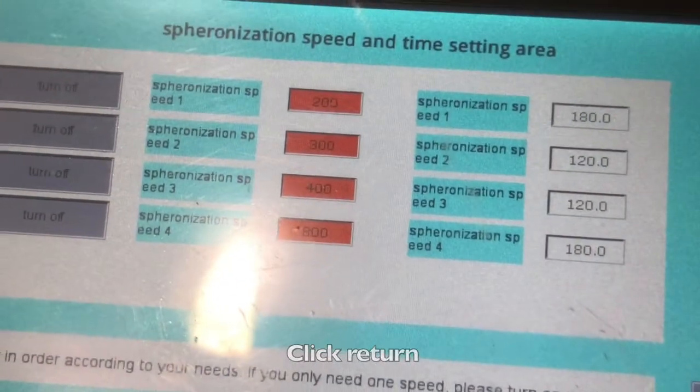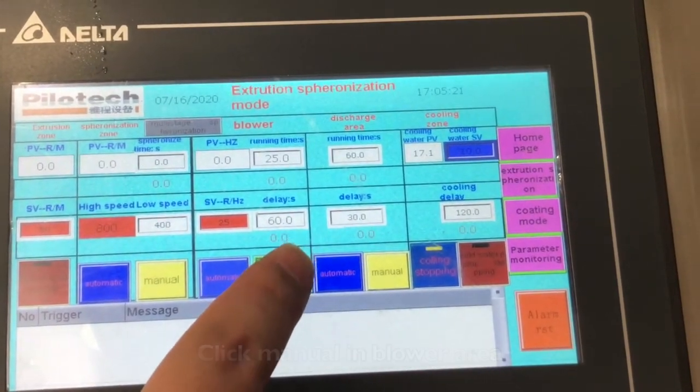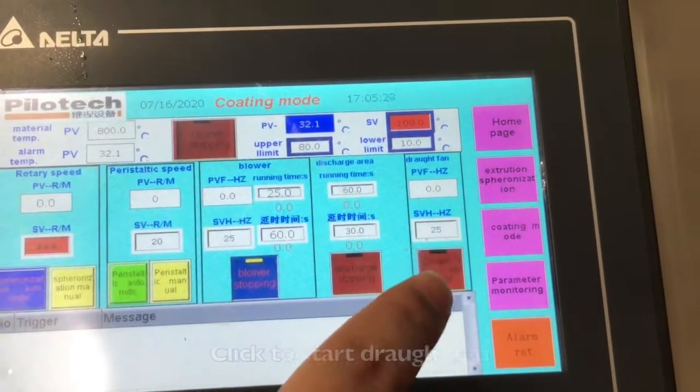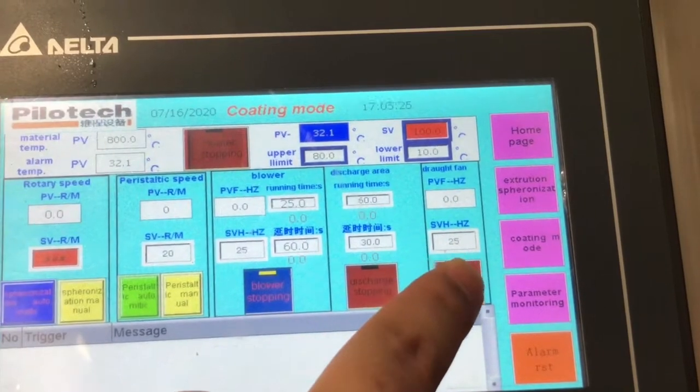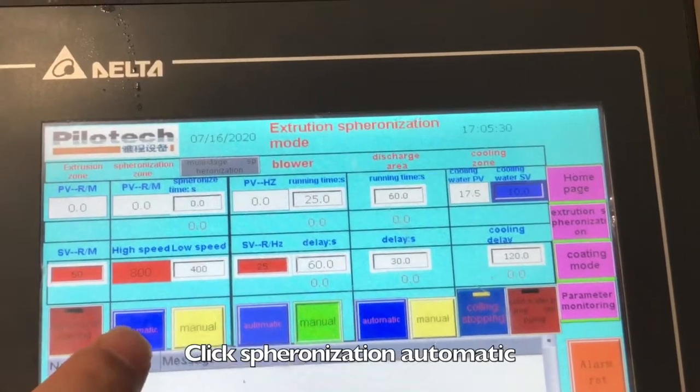Click return. Click manual in blower area. Click coating mode. Click to start draft fan. Then click extrusion spheronization. Click spheronization automatic.